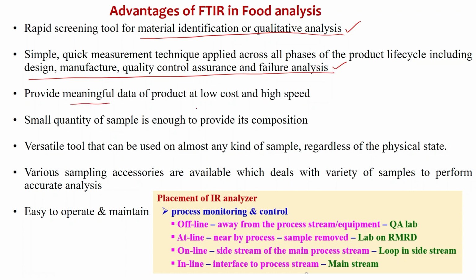It gives meaningful data of the product at low cost and high speed. A small quantity of sample is enough, not a large quantity, and it is non-destructive to the sample. It is a versatile tool that can be used for almost any kind of physical state. So solid, liquid or gas, all types of samples can be determined using IR spectroscopy.